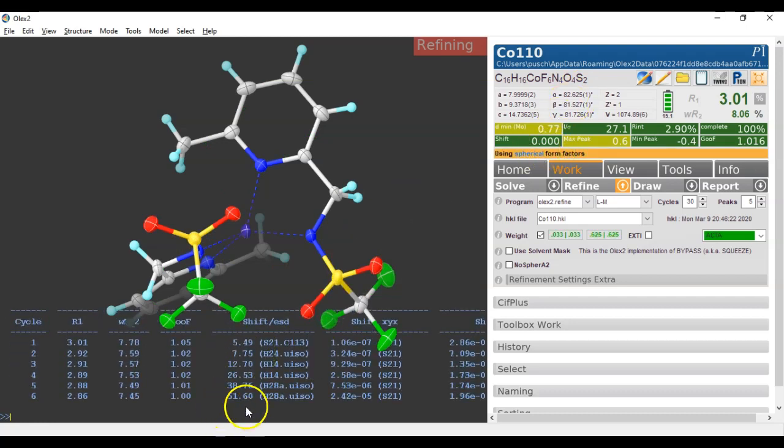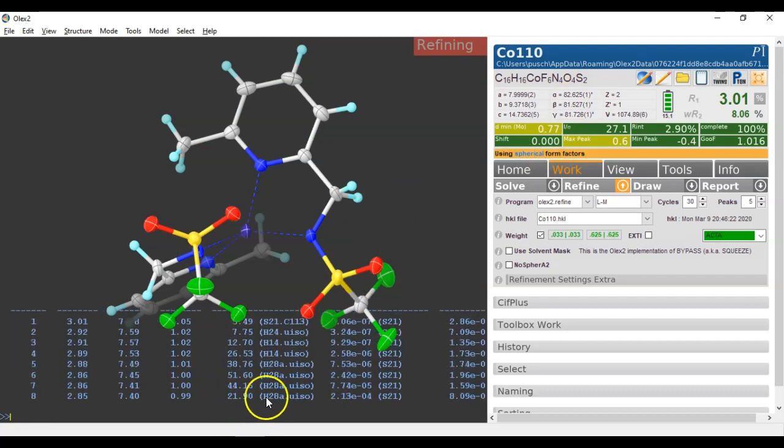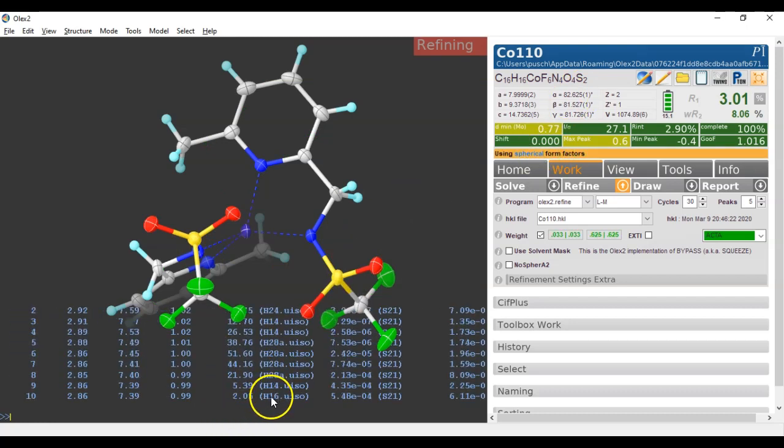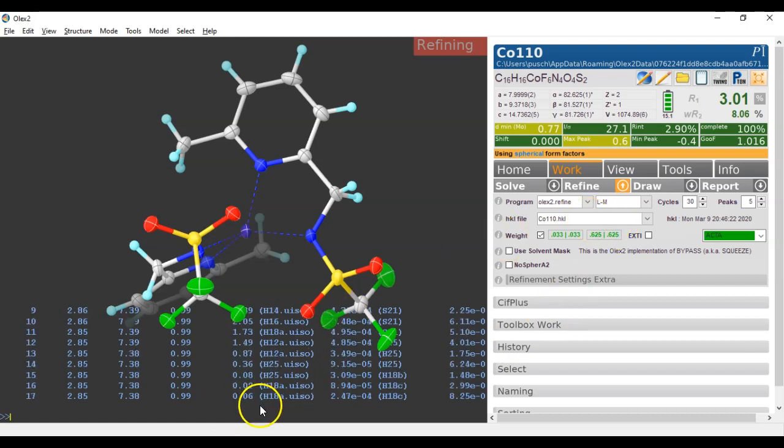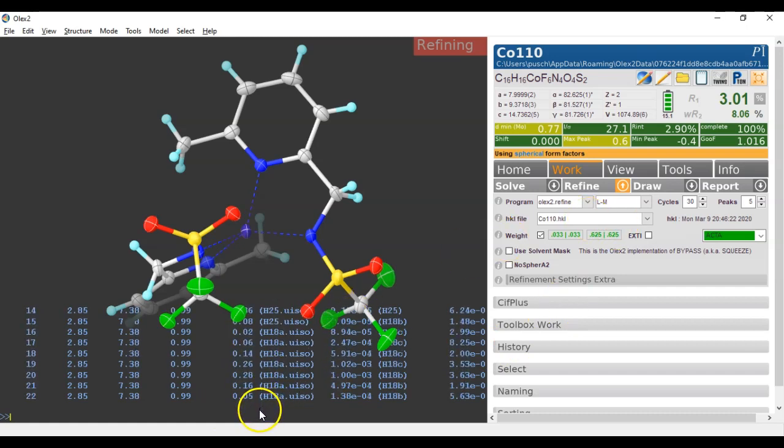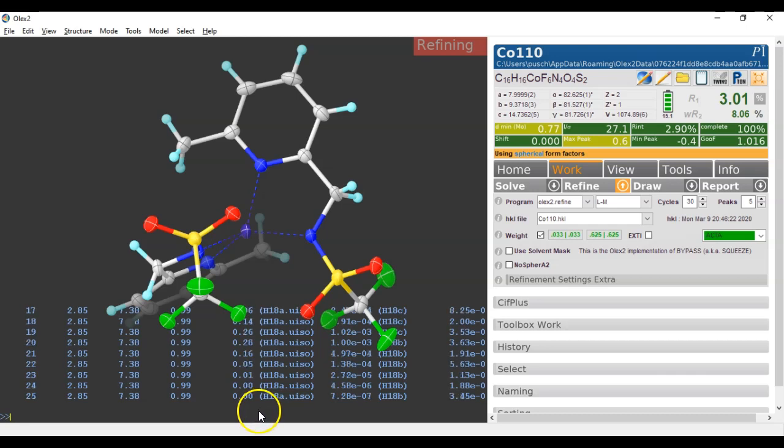A few cycles will be required. Watch this column. Watch this to go to zero. Sometimes we need to restart it again before it settles. But it's settling. Oh, it's going up again. Sometimes that happens. It's going down. And it should have settled now.